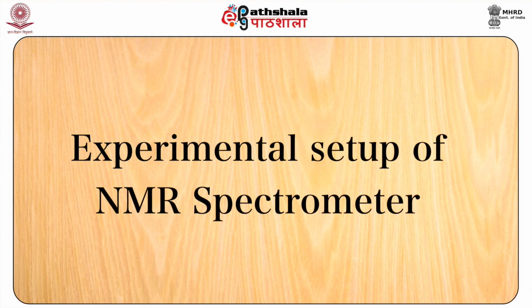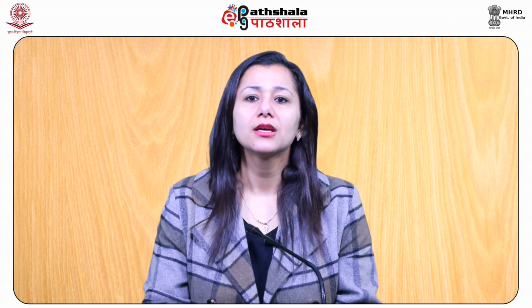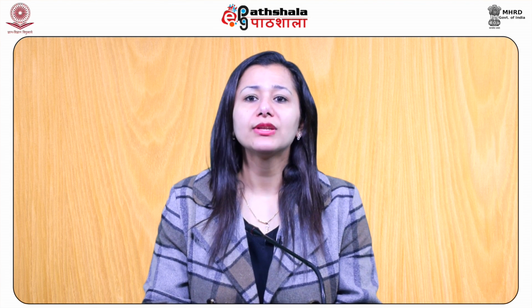Now, we shall see the experimental setup of the NMR spectrometer. To begin with, the NMR spectrometer must be tuned to a specific nucleus, in this case the proton. The actual procedure for obtaining the spectrum varies, but the simplest is referred to as the continuous wave, that is the CW method. A solution of the sample in a uniform 5 mm glass tube is focused in between the poles of a powerful magnet and is spun to average any magnetic field variations as well as the tube imperfections.